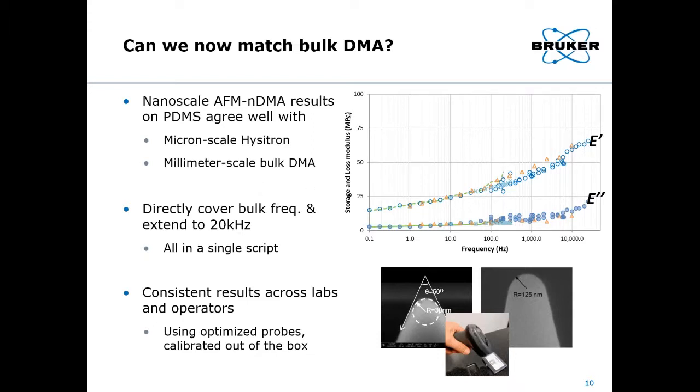Okay, good. Another question here, which may be one for Beat. It refers to the FEP data, where it says, Beat, you showed a master curve with frequencies up to 10 to the 18 hertz or something. So the question is, how did you measure at that frequency?